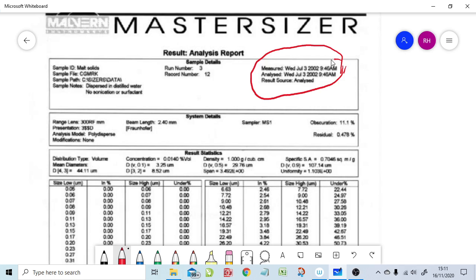It's a little bit more attractive. This is rather basic, but the important things are illustrated here and are relevant to modern presentations. I really want to focus on the statistics, but I'll just say a couple of things about the setup itself, which here is called the system details. There's two things here.